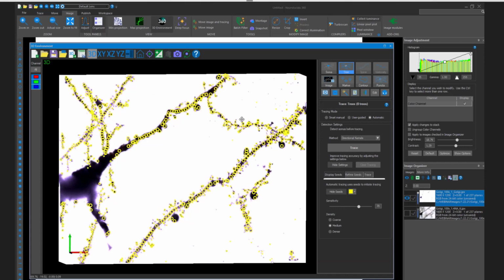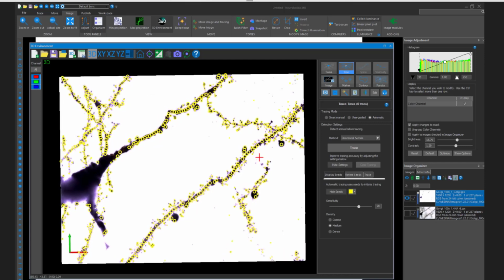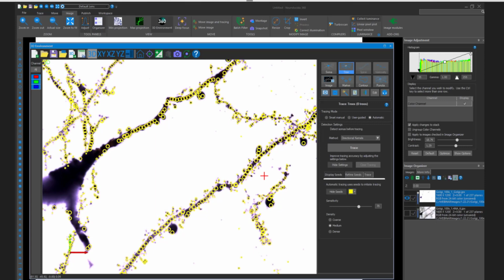To give you an example, this is a fairly small image. It took about 45 seconds to run this through the Golgi filter. So while I was talking, I was working and setting this up. One thing to keep in mind when working with spine data is that obviously we want to be as automatic as possible.